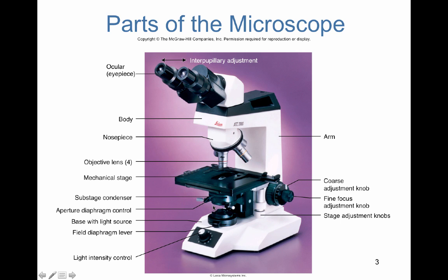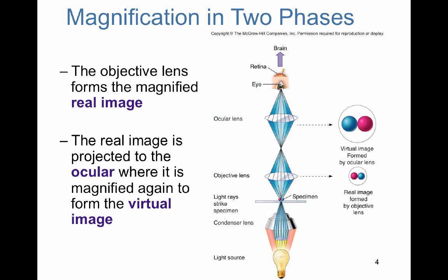Now there's a couple series of refractions that occur here, and this is why the refracted light from the stage at this high objective, which would usually be on this scope 100x, the immersion oil would actually capture all of that light that's bouncing off of the stage. So because it's capturing all of that light, it provides for the highest magnification and highest resolution for this instrument.